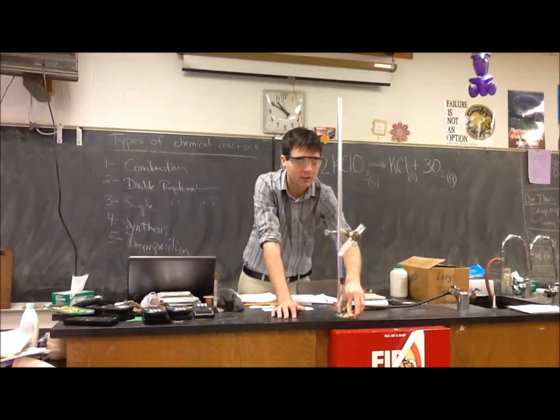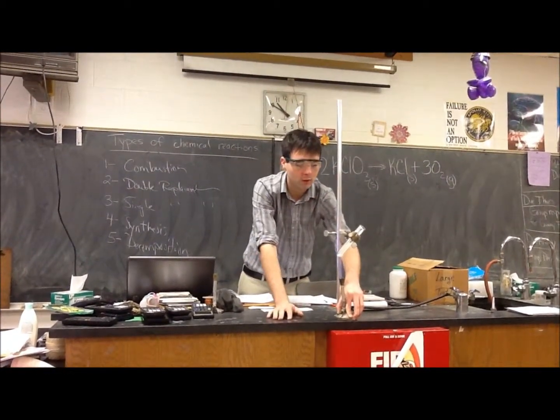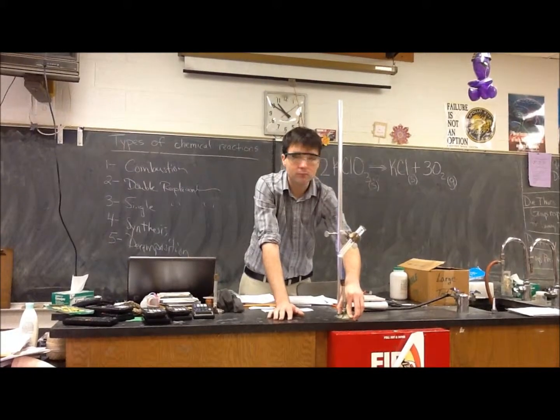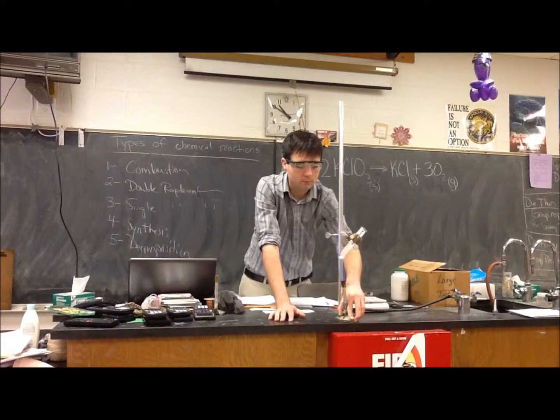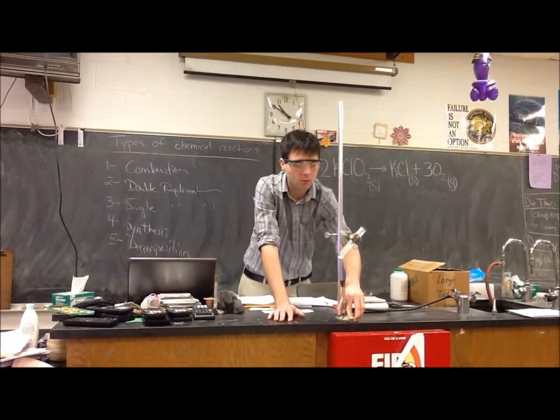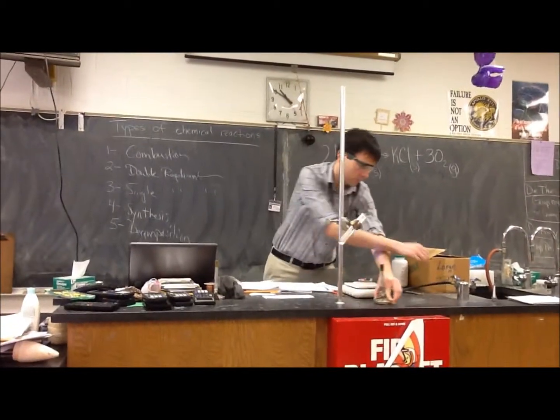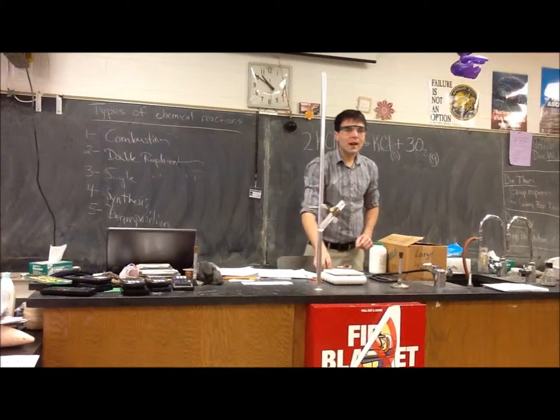We have the formation of a gas, and it is oxygen gas because we looked at the chemical equation. And it's almost a complete liquid. It's fairly warm, I'm sure. That's what's making it into a liquid, this heat. Some more bubbles. So we got a whole bunch of oxygen inside of this test tube now. Turn the gas off.